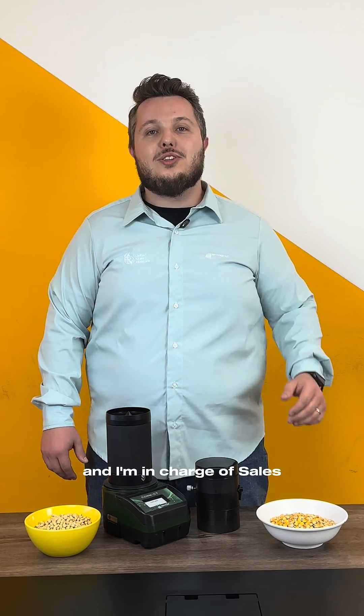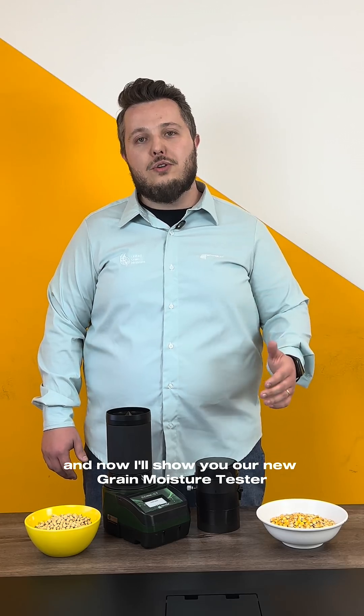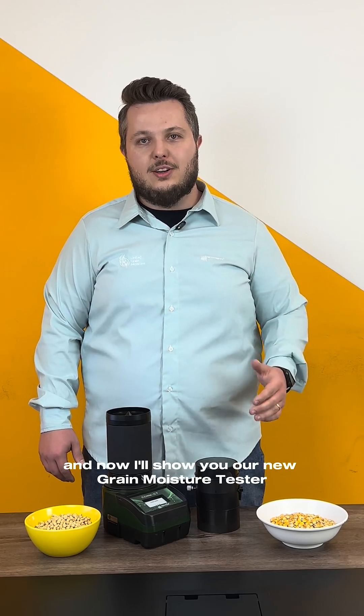Hello, I'm Luis and I'm in charge of the sales department of United Grain Moisture, and now I will show you our new Grain Moisture Tester, the Motonko Connect.